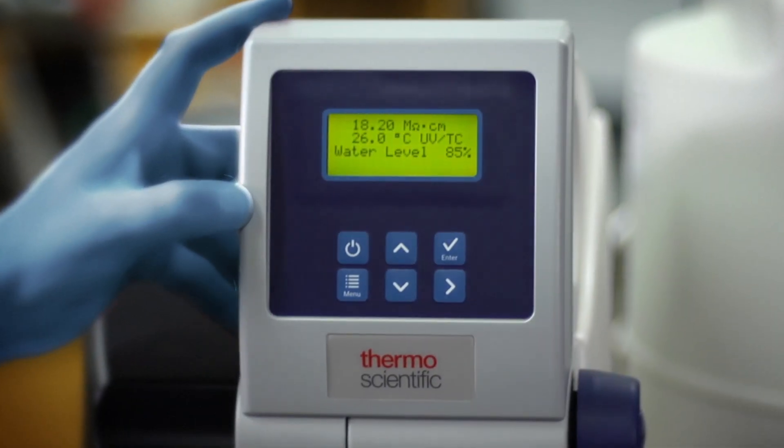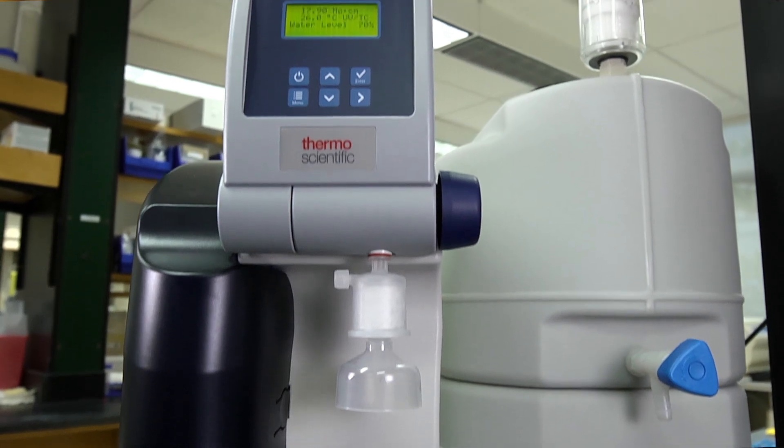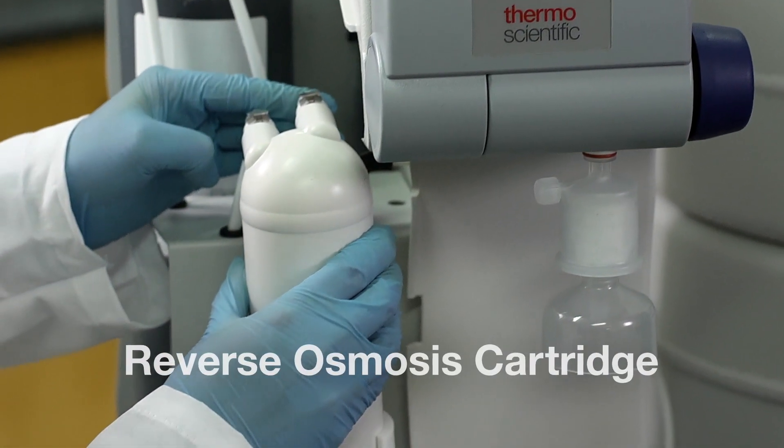SmartPure Pro also offers a display that can be tilted, and a leak detection sensor prevents lab flooding. The unit can be easily wall or bench mounted and installation is simple. When it's time to change out the cartridges, just snap and go.